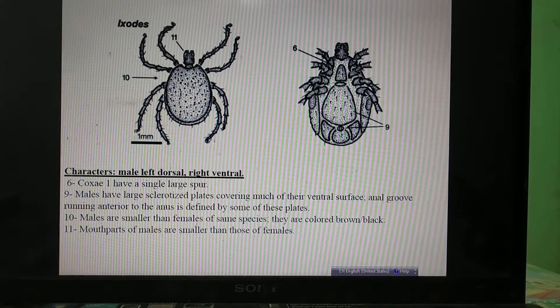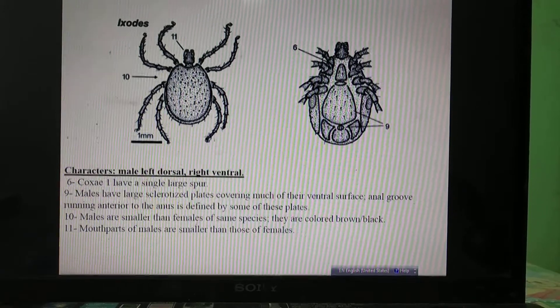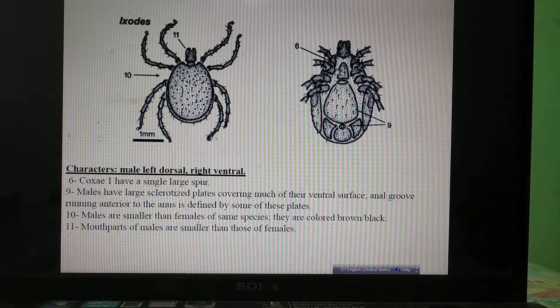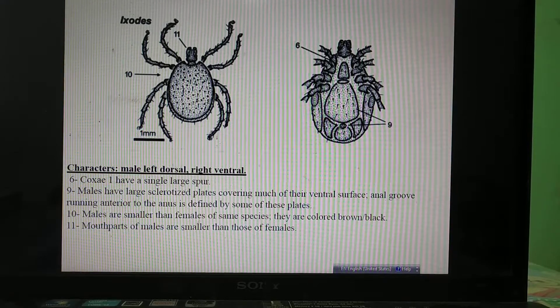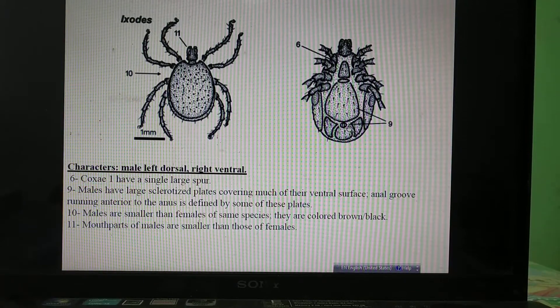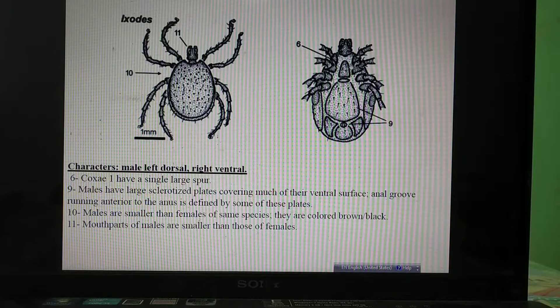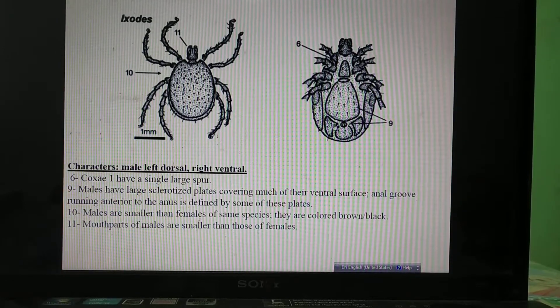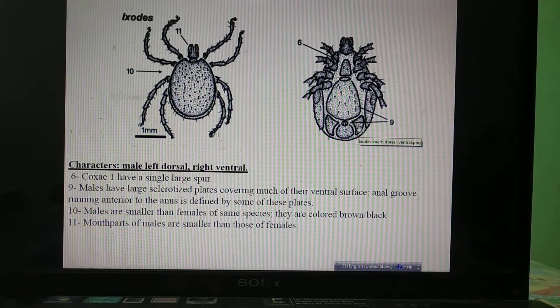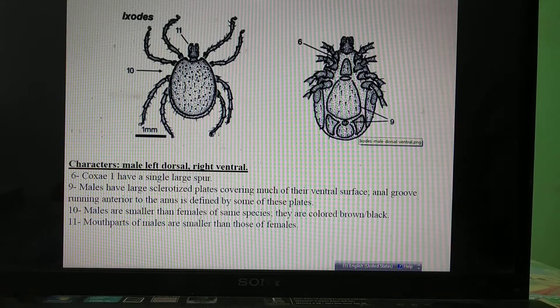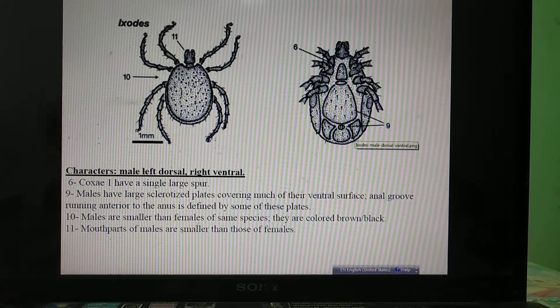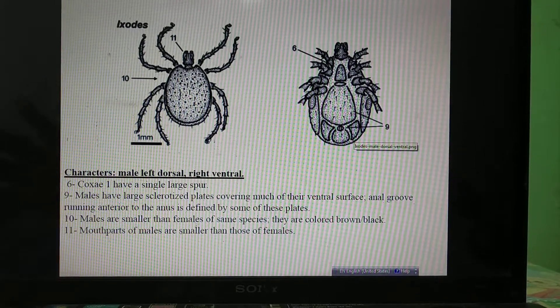In the male, ventral plates are present. There is a ventral plate anterior to the genital pore, posterior to the genital pore, adjacent to the genital pore, and posterior to the anus. So ventral plates cover anterior to the genital pore, posterior to the genital pore, lateral to the anal pore, and posterior to the anal pore — the entire ventral surface is covered by sclerotized ventral plates.